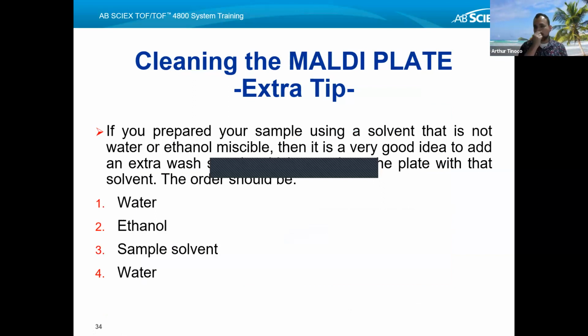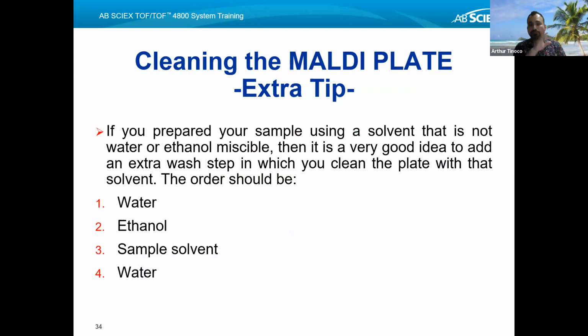So let's imagine that you prepared a sample in a solvent. And as I mentioned to you, you're not limited by the solvents that I mentioned before. If you use a solvent that's not miscible with water or ethanol, then my suggestion is to use that solvent as part of this cycle of cleaning the plate after you have used and collected your data.